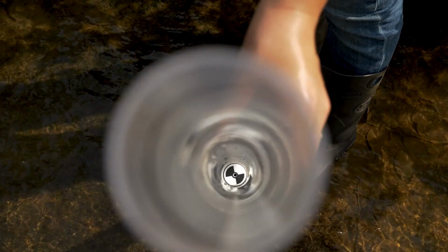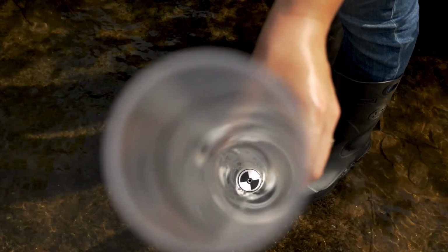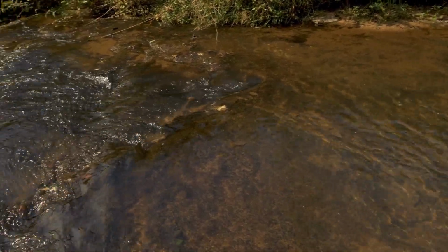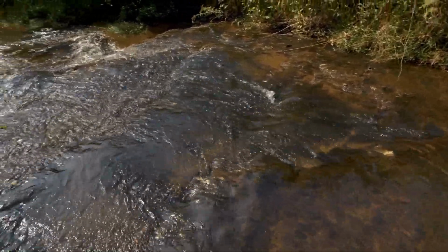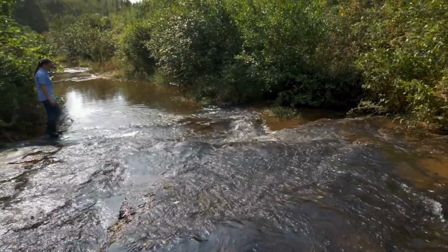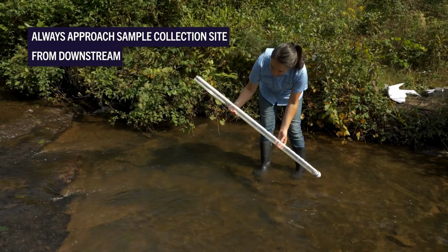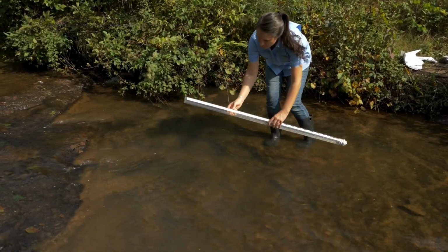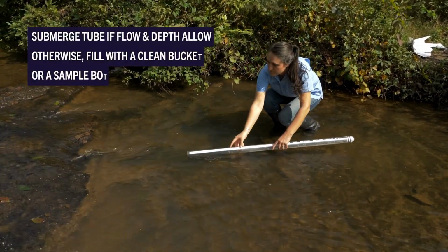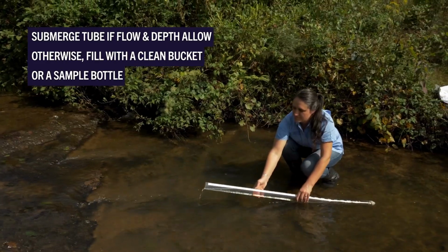There are several different models of transparency tube, but they all work on the same premise: determining the depth at which you can begin to decipher the black from white quadrants of the Secchi disc inside the tube. First, be sure that your actions in the waterway are not impacting a marsh or stirring up bottom sediments. Approach your sample collection site from downstream. If flow and depth allow, you can directly submerge your tube. Otherwise, use a bucket to collect your sample from an area of undisturbed flow.